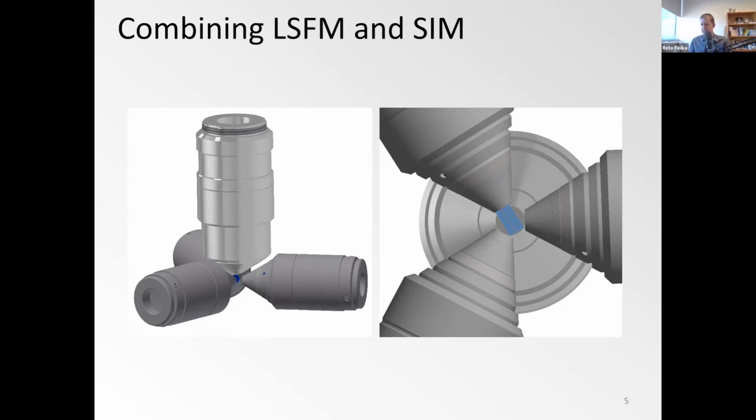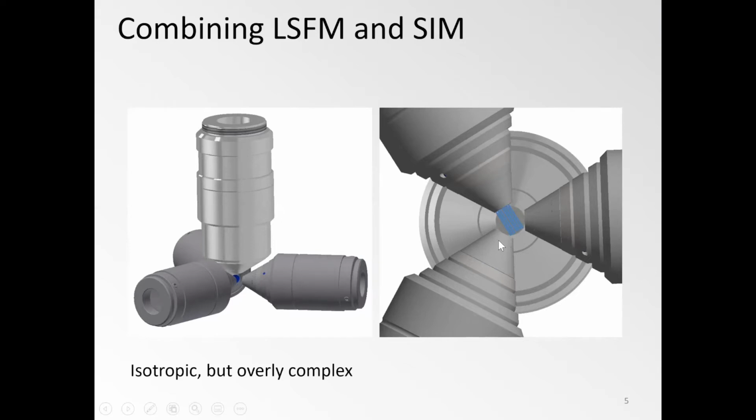Not sure if this work is in the process of being published, but nevertheless, one has to say that this is quite a complex machine. You essentially would need to weld together 3 lattice light sheet illumination trains and somehow wedge in a sample, which becomes quite challenging, because if you use a glass cover slip, no matter how you orient it, it will somehow refract either the excitation light or the detection light.